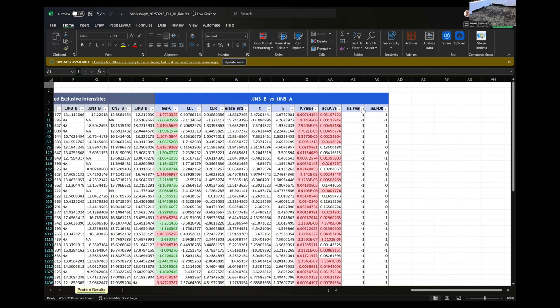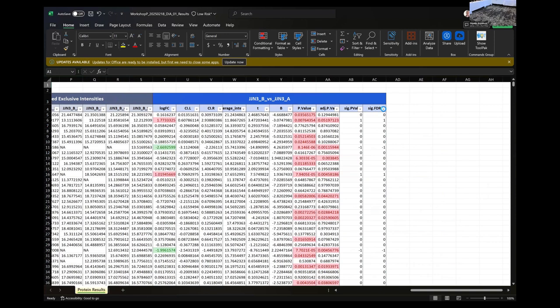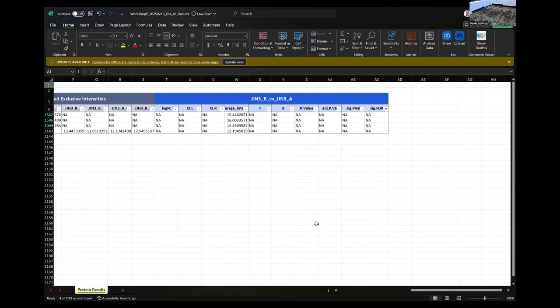And then the other thing we can do, I told you about the NAs.